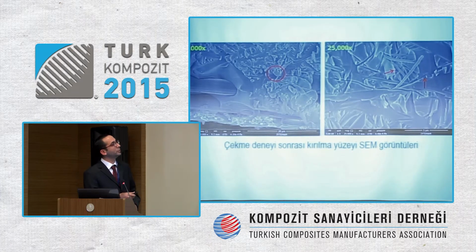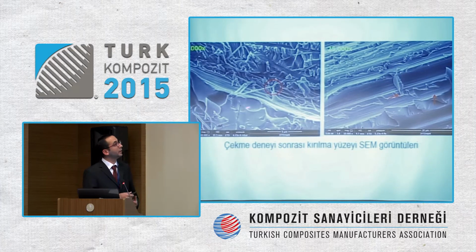And you can see the tensile test results, and we know the temperatures of curing, and in here the nanofibers and epoxy, we can see the nanofibers and epoxy through the SEM images. And in that image, when we look at from that scale, the plastic deformation of nanofibers is visible after the tensile test.